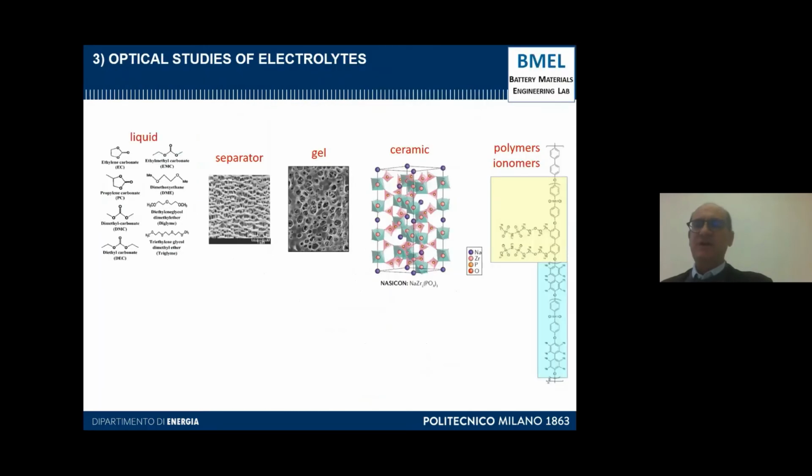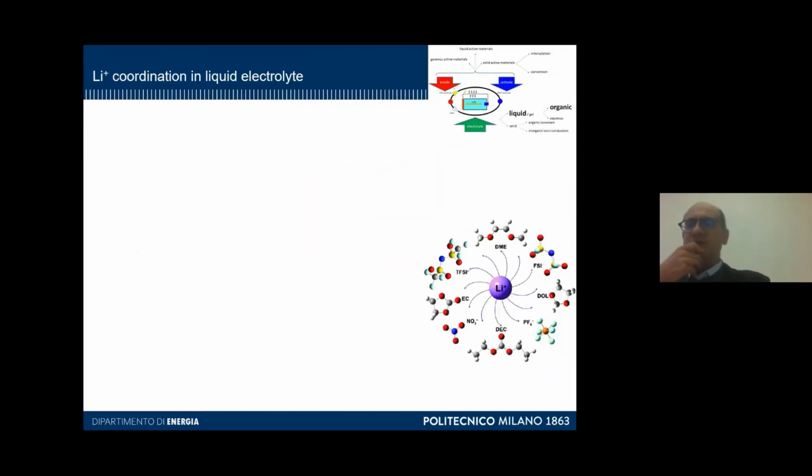localization of adsorption. Now, regarding the last cell component, namely the electrolyte, a crucial issue is the determination of the coordination of lithium ions by solvent molecules.